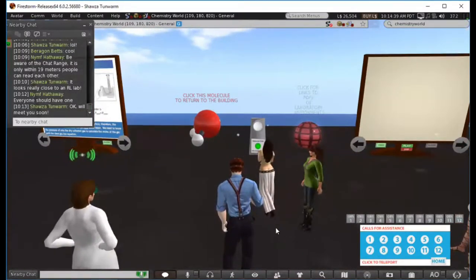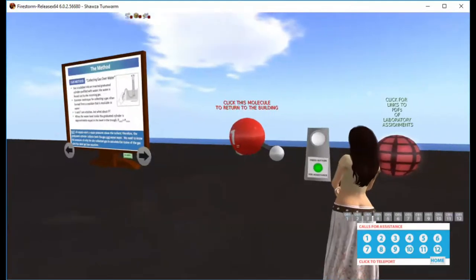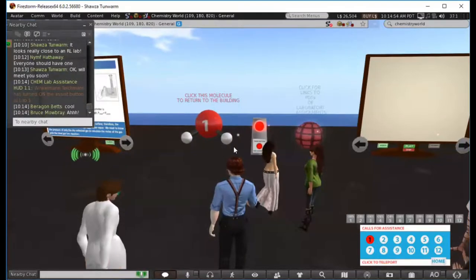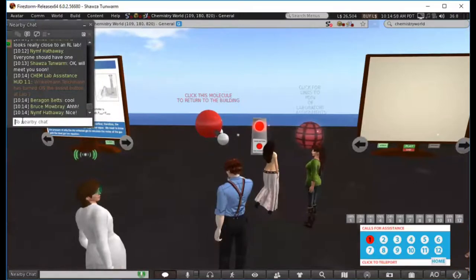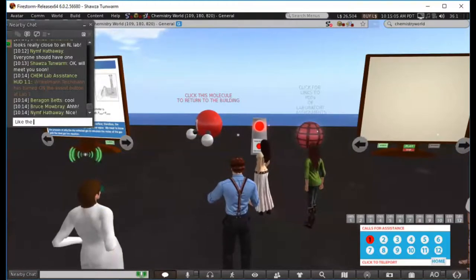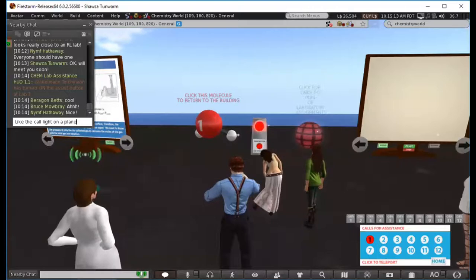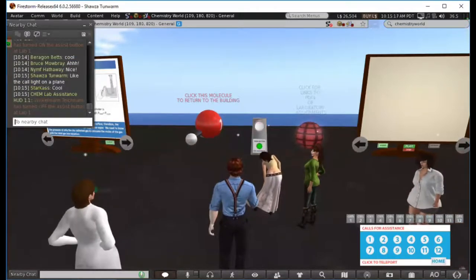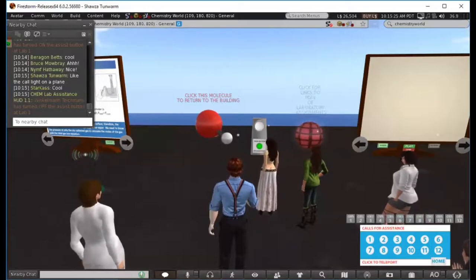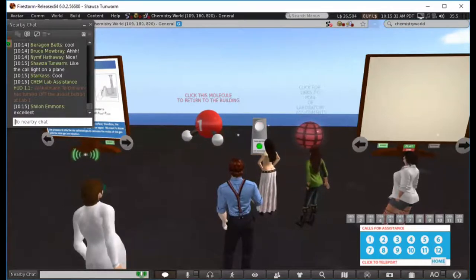Next to the water molecule is this little thing with the green button. If I click on that, watch what happens to your HUD. The lab station number 1 spot on the HUD just turned red. Now, if you were an instructor on some other lab platform, you would know immediately that students in station 1 have a question. Maybe you've got a couple of lab instructors who are helping out. One of them goes there and clicks on it, and the red alert goes away. And so the other lab instructor can realize that somebody else has helped those students. Maybe the students had a question, but then they figured it out themselves, so they canceled the alert.